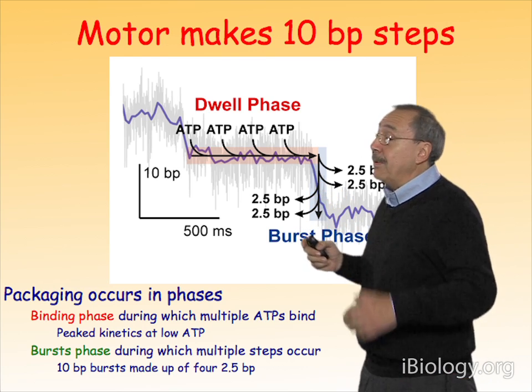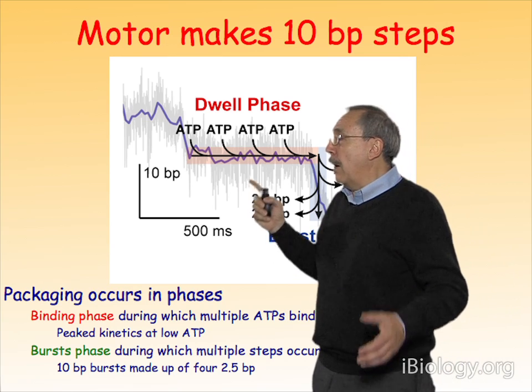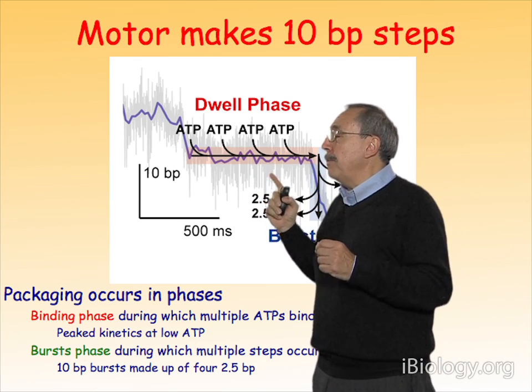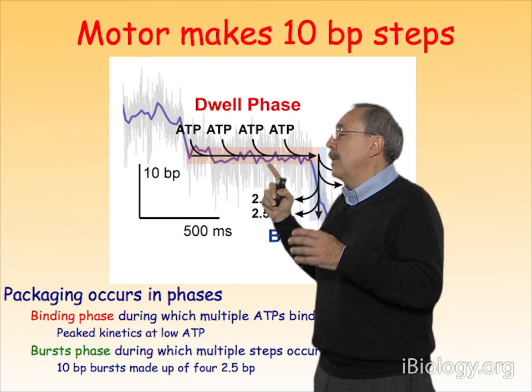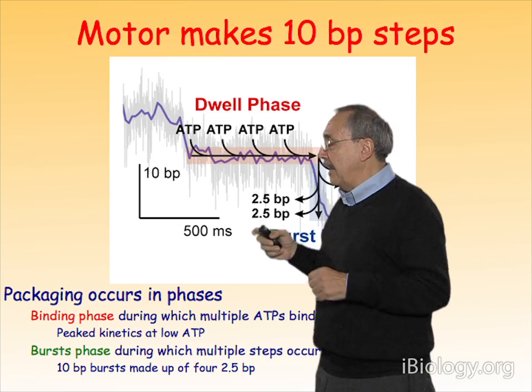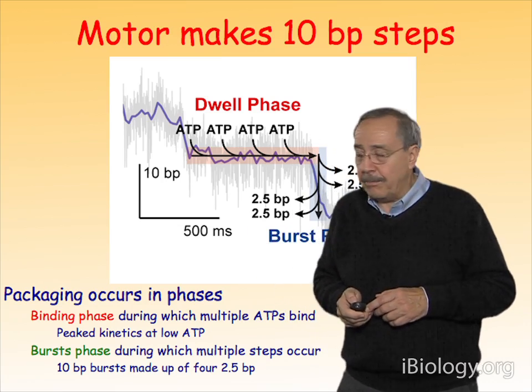Now, what happens to the 5th subunit? Well, now we know that the 5th subunit also binds ATP, also hydrolyzes ATP, but it does it for regulation. So it regulates the cycle of the other 4 ATPases. And that's data that is now just being published in the lab.